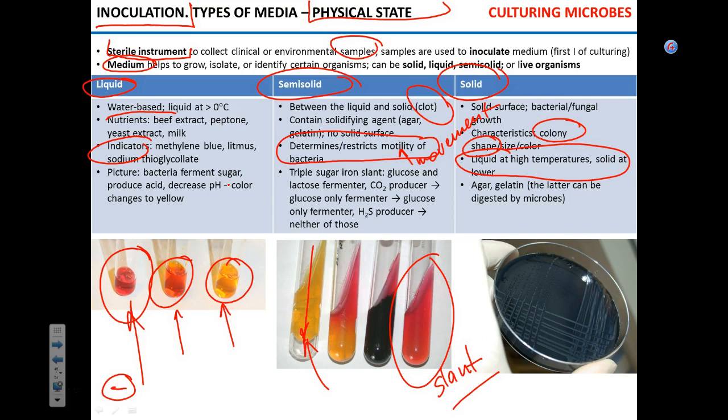If it's motile, so if this is the wire coming through, bacteria will start to spread to the sides. Does that make sense? Producing this spread growth. So this is motile bacteria. That is a really convenient way to address motility. Am I clear? But perhaps more frequently, semi-solid medium is used to figure out different types of microorganisms using indicator media.